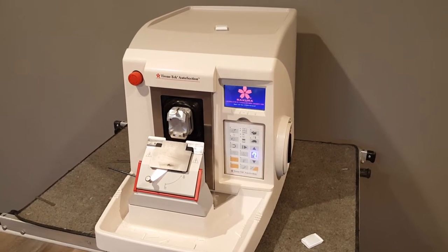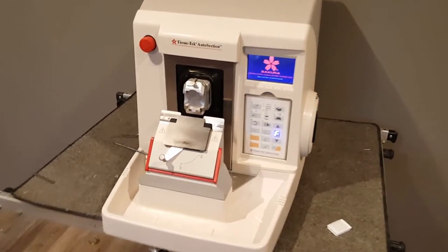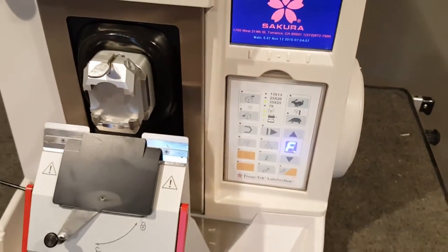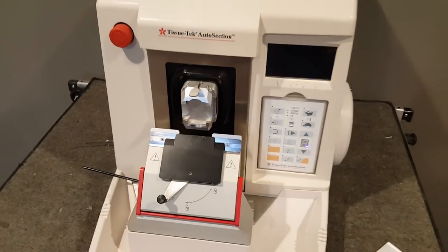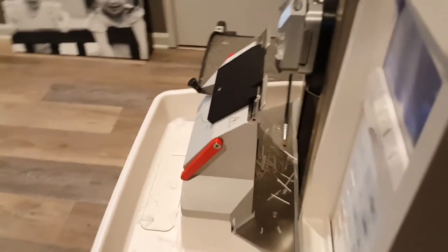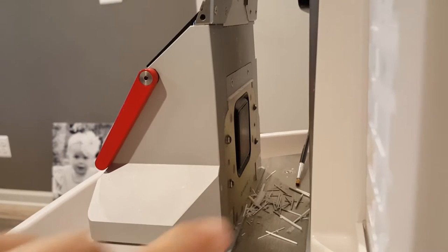It's got a 3 by 4 inch color touchscreen up there on the top right, and this right here is a Bluetooth remote — you can actually pull it out. It's going through its initialization right now. As you can see, I've used it a little bit so you can see some of the paraffin sections.